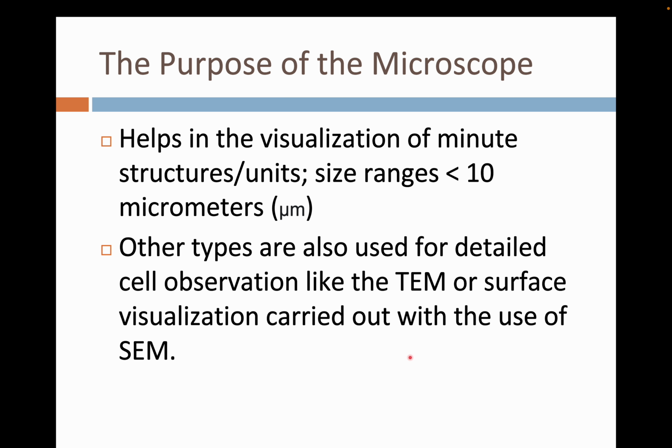Okay. Other types are also used, as I already mentioned, the TEM and SEM. If you want to see more details about your specimen, you can make use of them. So we don't have TEM or SEM in our campus, but in others, like I think in De La Salle, Manila, they have electron microscopes that can be used for such purposes.